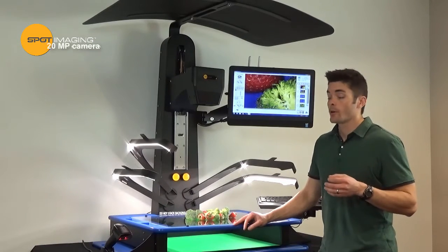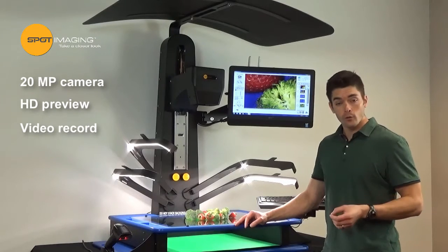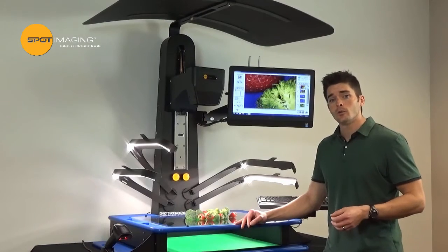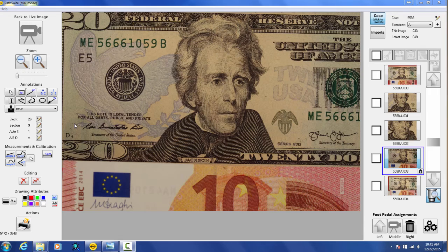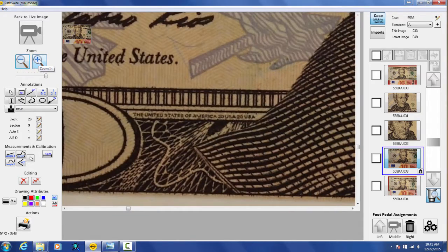The 20 megapixel camera has auto brightness, auto focus, HD preview, video record, and video conferencing capability. This high resolution allows you to take a picture of your entire specimen and crop sub-regions of that specimen and still end up with enough resolution to be publication quality.